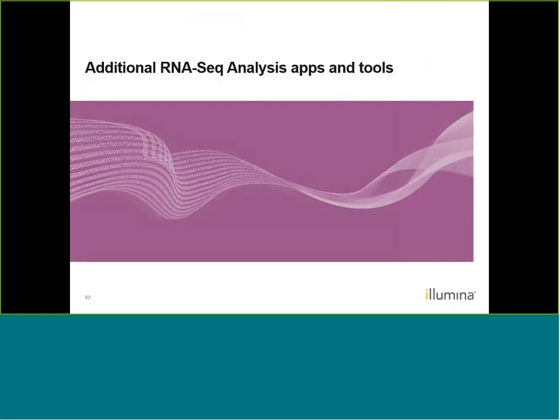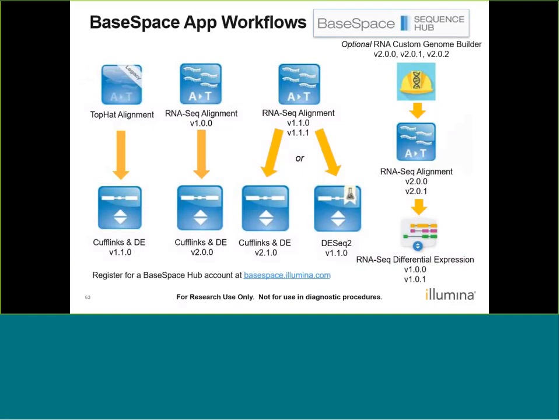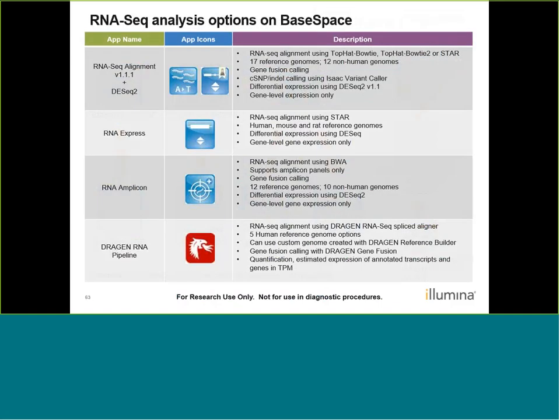Okay, so with that, let's go ahead and wrap up and start discussing some other RNA-Seq analysis apps and tools that we have available. So again, we've thoroughly discussed the RNA-Seq Alignment workflows, and these workflows are geared for libraries that will be prepared with the TruSeq RNA, TruSeq total RNA, TruSeq stranded mRNA, basically these whole transcriptome types of analysis. But you may have different types of RNA-Seq libraries that you'll want to use different apps for.